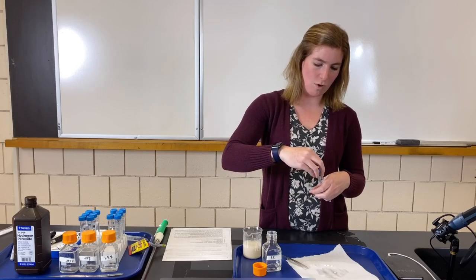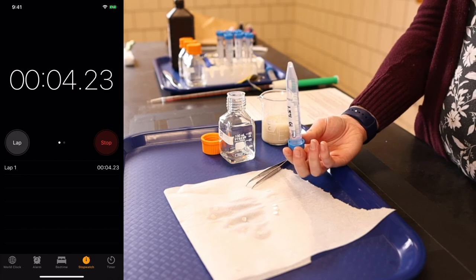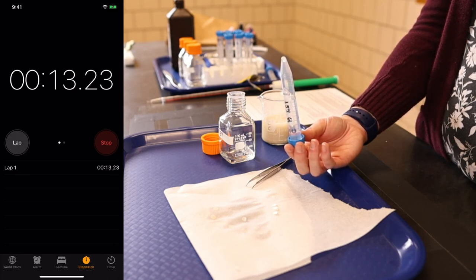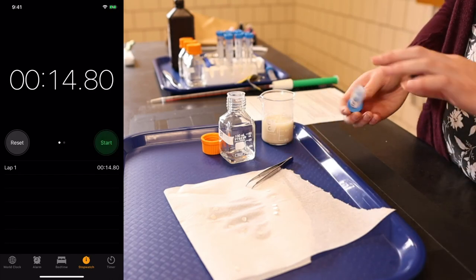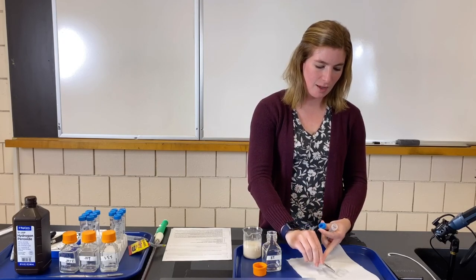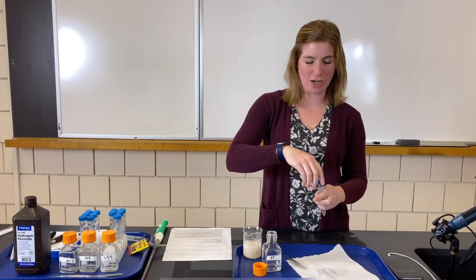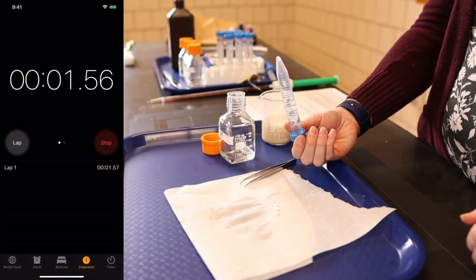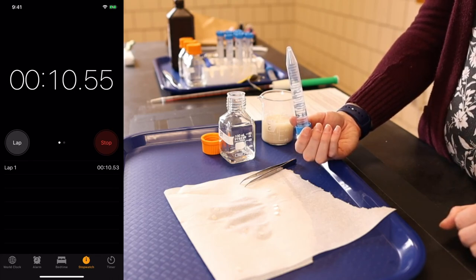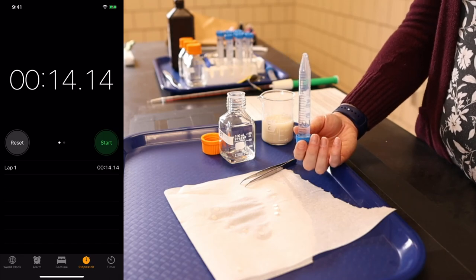Trial two for 1.5% — in the first trial it took a little longer than 3%, which should make sense. Think about what you'd expect as concentration gets smaller and smaller. Trial two: 14.8 seconds. While you're thinking about this, consider what you might do to make the reaction go faster. As concentration goes down it seems to be taking longer. Trial three: 14.14 seconds.